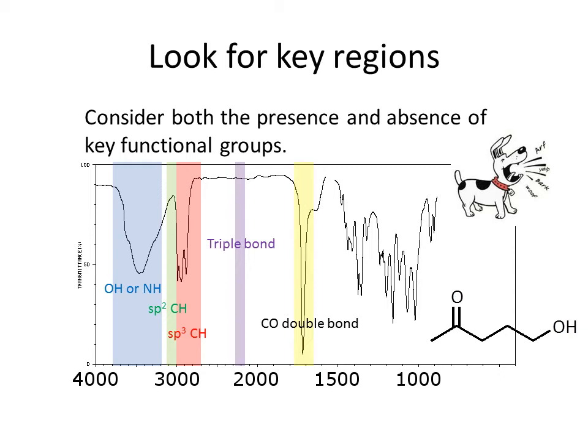By the way, I should note, my presentation of spectroscopy is going to be highly practical. I'm not going to spend so much time on the theory. I'm going to spend most of my time on looking at the spectrum and seeing what I can learn about the molecule. So for instance, I'm going to look at essentially 5 regions in the infrared. I'm going to look in this region, around 3300, 3400.